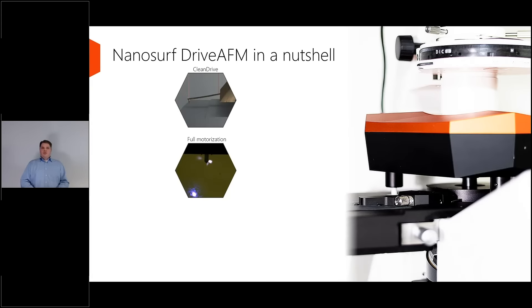The clean drive is a very easy to use way to do dynamic mode imaging. It is very stable and this way improves the operation of the system greatly and allows to stably and conveniently use the system.